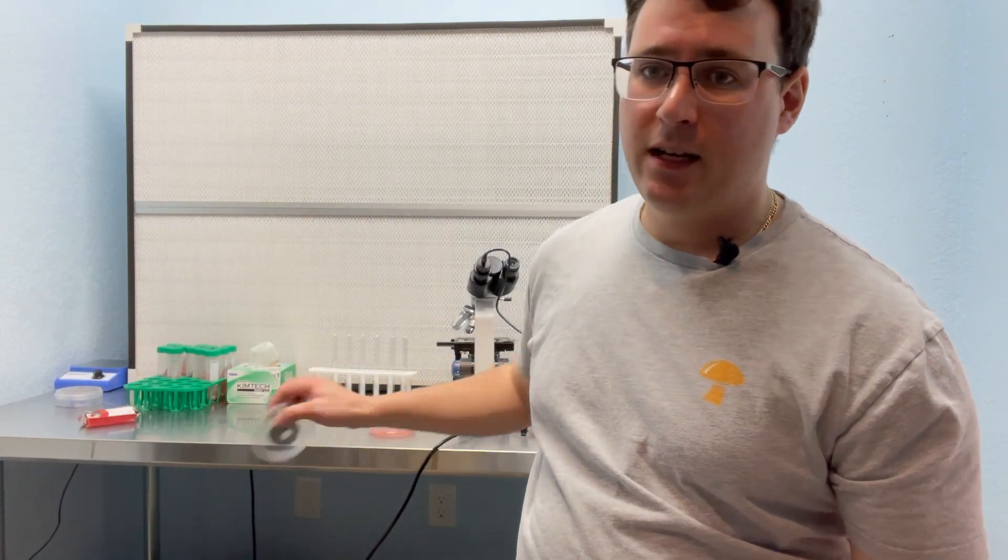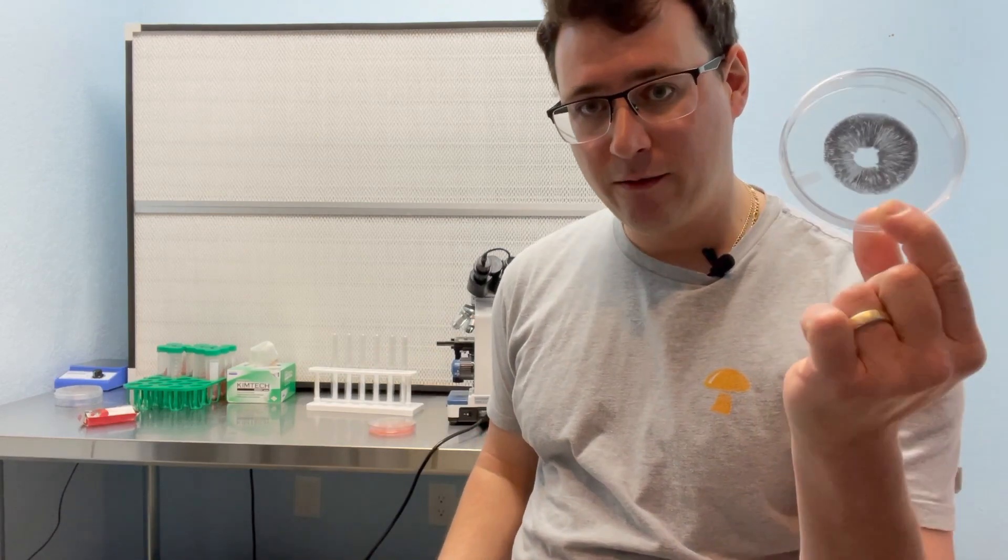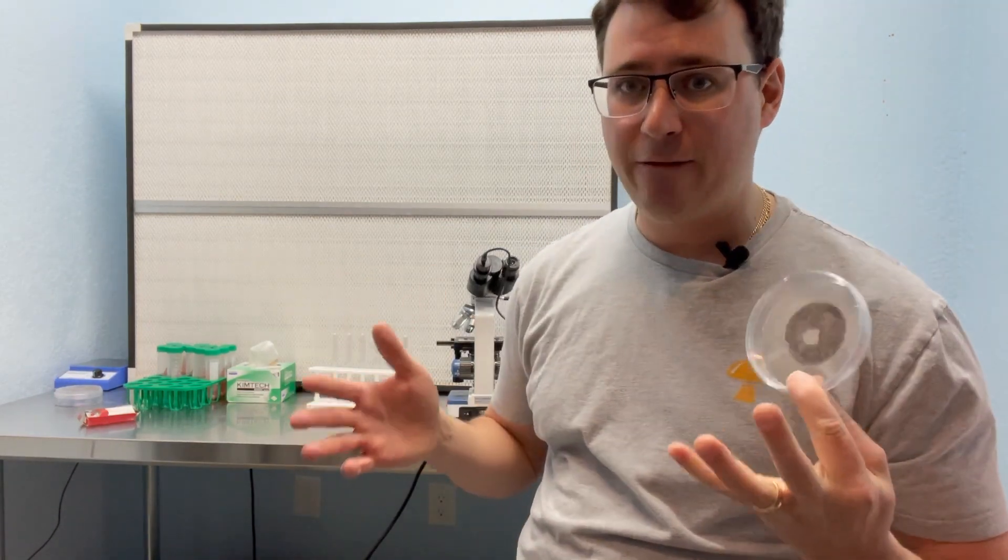If you have fresh spores that you just put onto a petri dish like this print here, it's going to work much better because the percentage of single spores to CFU is going to be much higher.